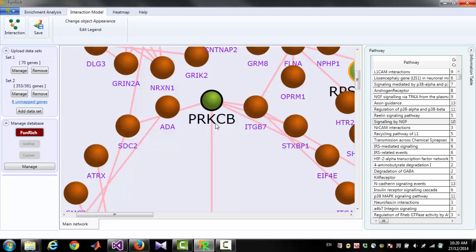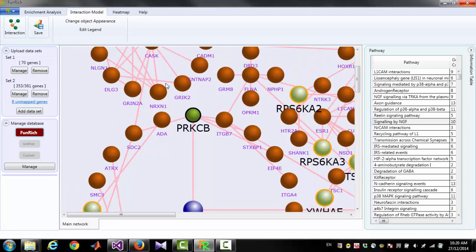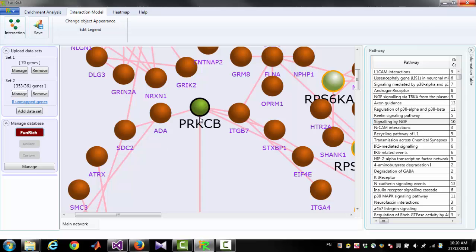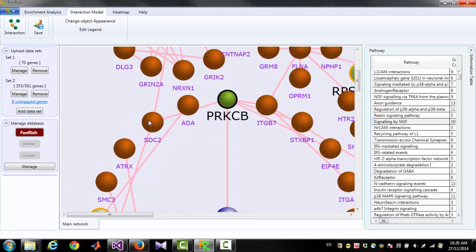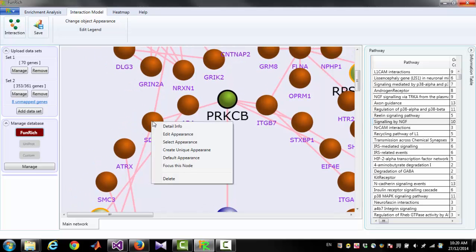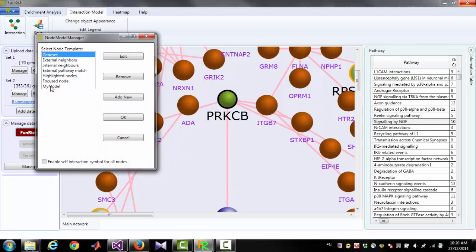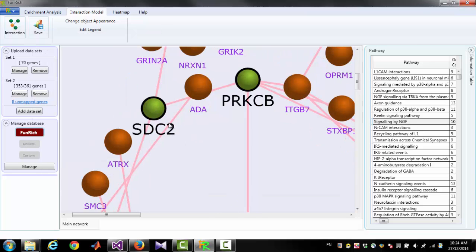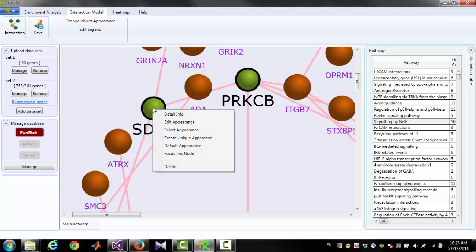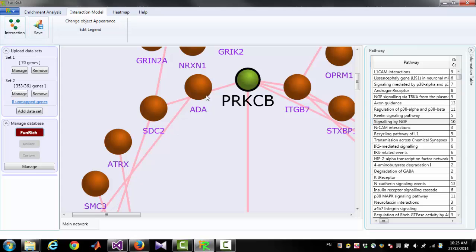This node now has a unique appearance which is not shared by others. If you want the same model applied to other nodes, you can right-click another node, click 'Select Appearance', and select 'My Model' and click OK. If you want to get back the default appearance for a node, right-click and click 'Default Appearance'.